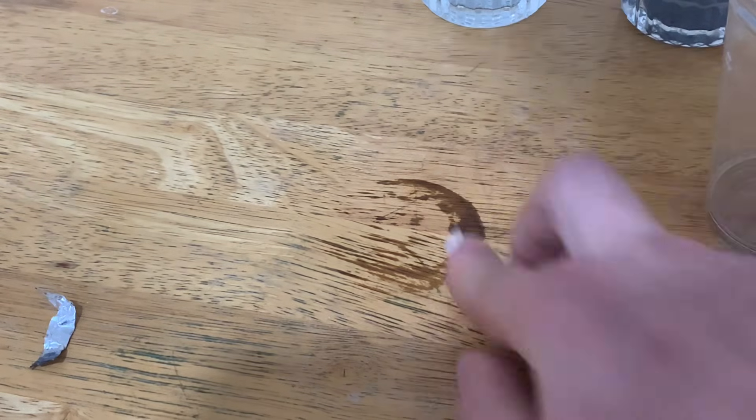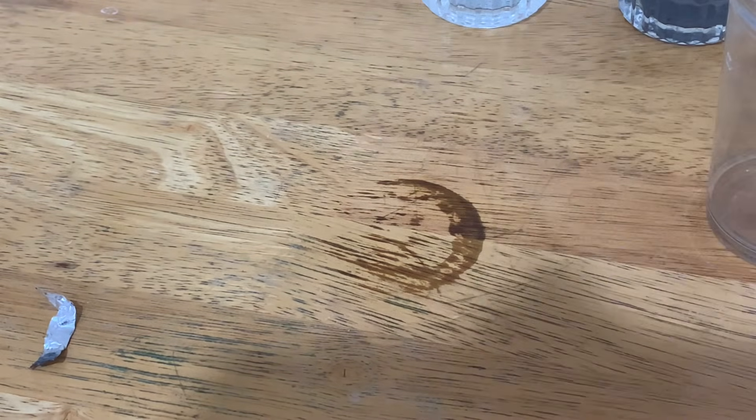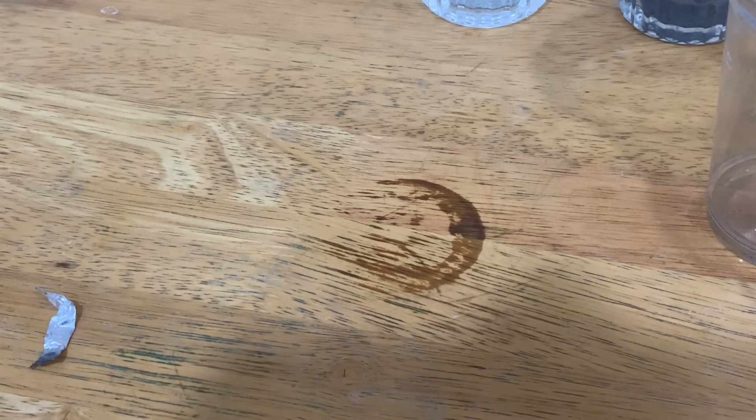That's your first-hand experience of what happens when you pour sodium hydroxide on a table. Don't make the same mistake as me, kids.